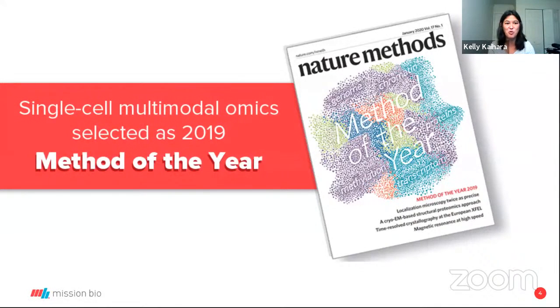We're starting to layer more analytes, including single-cell DNA-seq, ATAC-seq, and protein-seq. It's been a really interesting and beautiful phenomenon to follow how this field has exploded in the last 5 years, and we at Mission Bio are really excited to be a part of this explosion of new technology.